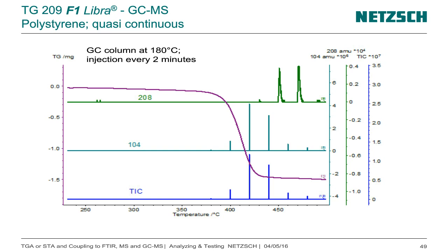But with chromatography, the dimer maybe took more time than the monomer, and the column temperature was only 180 degrees C. And there you see that the maximum in the TIC is a little bit too late, but with our column and our gas flows which we use, we have the transfer path from the TG to the GC, and there via the column even nitrogen, which does not really make chromatography, needs more than 1 minute, so it must be late, and this is not corrected.